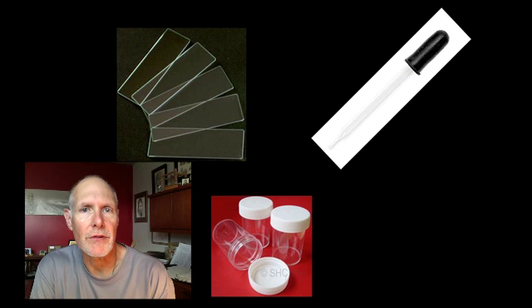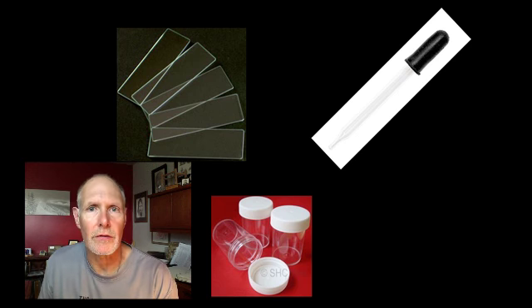and you're going to place it on top of the slide. Sometimes we want to have what we call a cover slip on top of the slide to keep things from moving around on us. And you can just actually use a second slide. Put that right on top, and that serves as a nice cover slip.